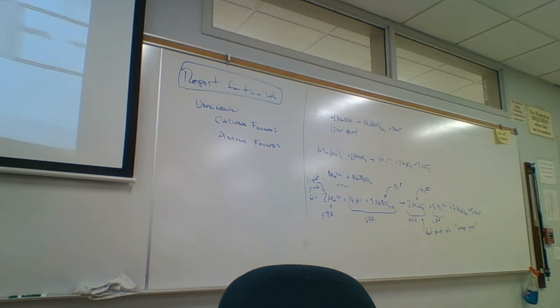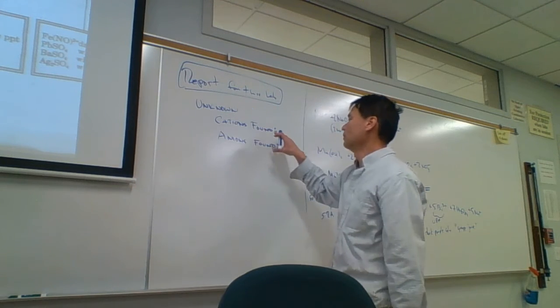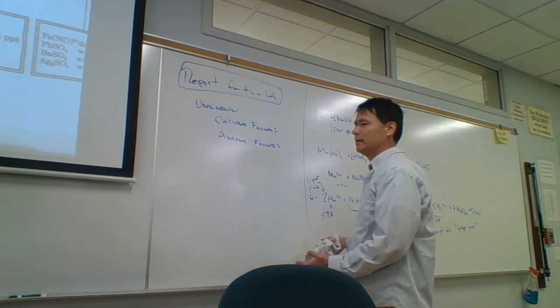And then for the ammonium test, let's look at the reactions for that. And so the unknown report part's going to be easy. Just list it. The known report part is going to be easy.